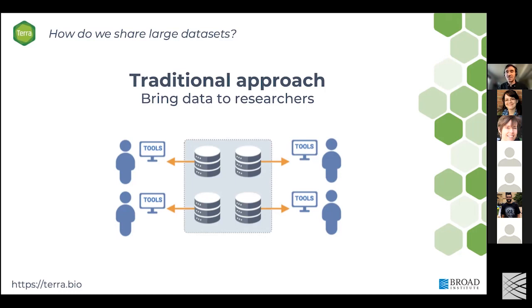Traditional bioinformatics looks like there's a central repository that holds the data. Each researcher copies it to local storage. They apply for and gain access, and then they analyze the data on their own local custom computing environment.